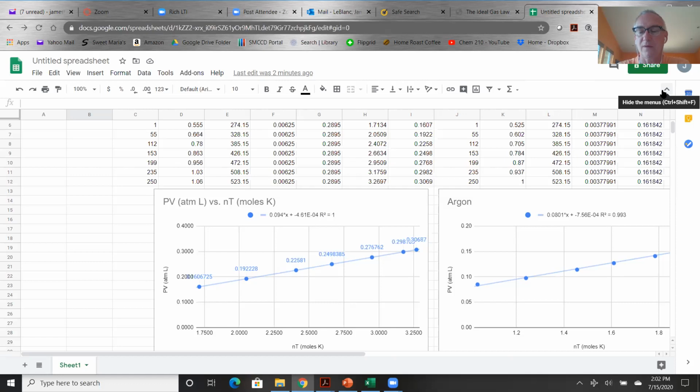Just to be clear, Professor, for this lab assignment, we will include the 3 graphs and the 3 data tables? Yeah. 3 data tables and a graph for each one. Yep. And if anyone figures out how to get us more than 2 or 3 digits on our slope, well, I guess that just means 0.0940, since we have 3 significant digits on the right and only 2 on the left. We could probably make that assumption, but I'm not sure why there'd be a difference.